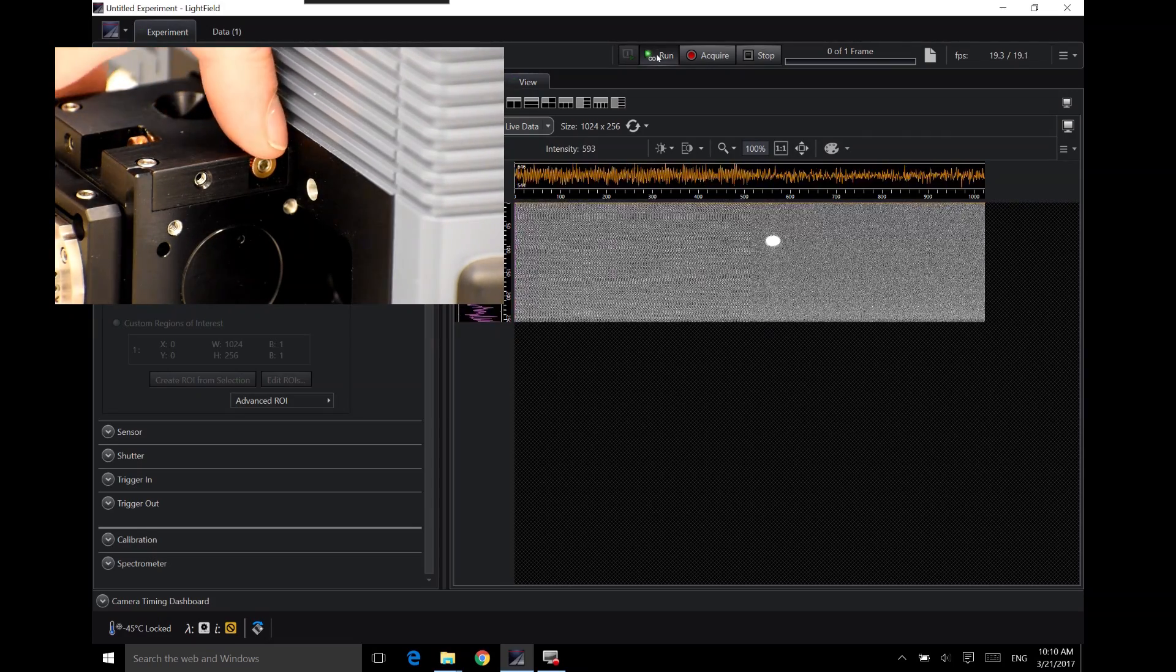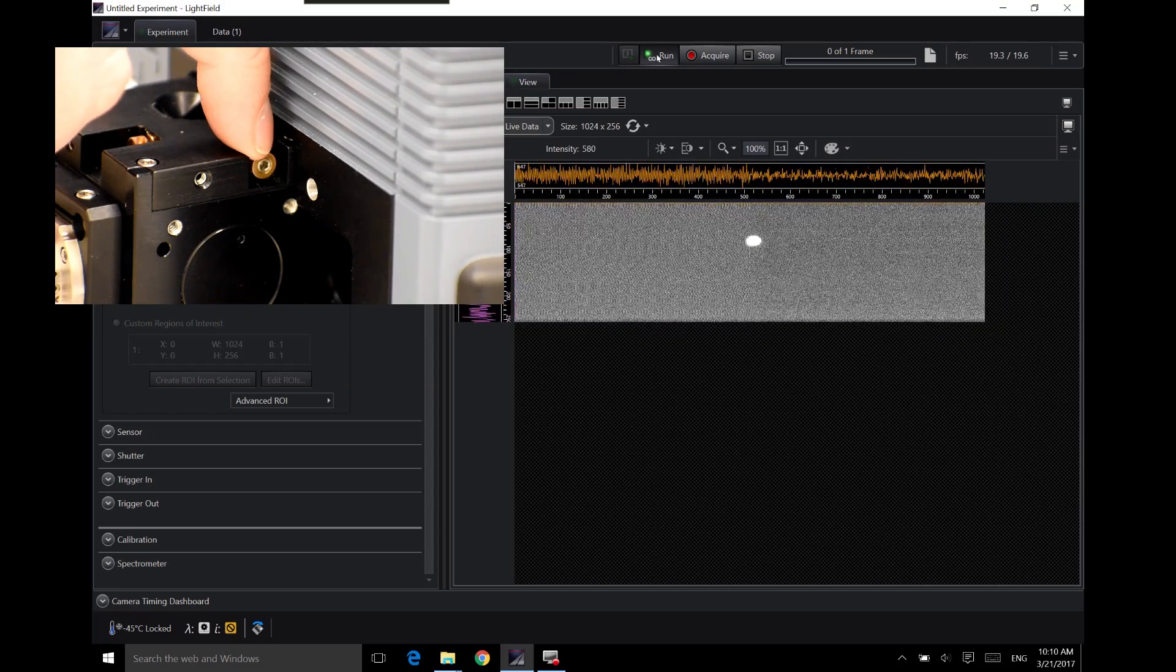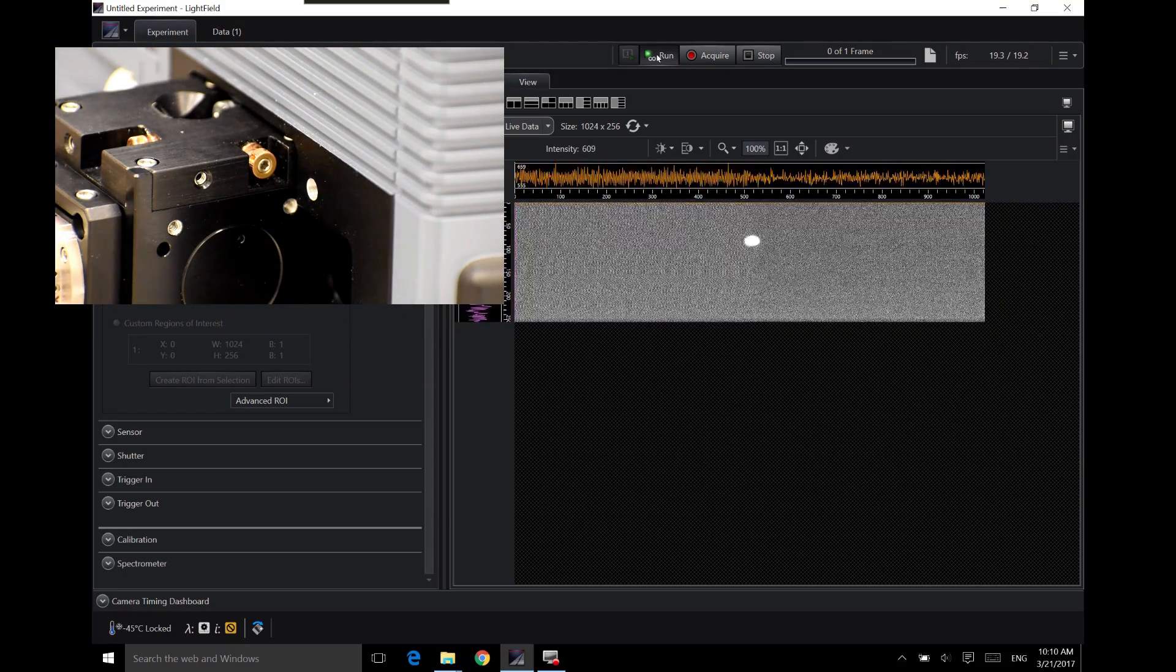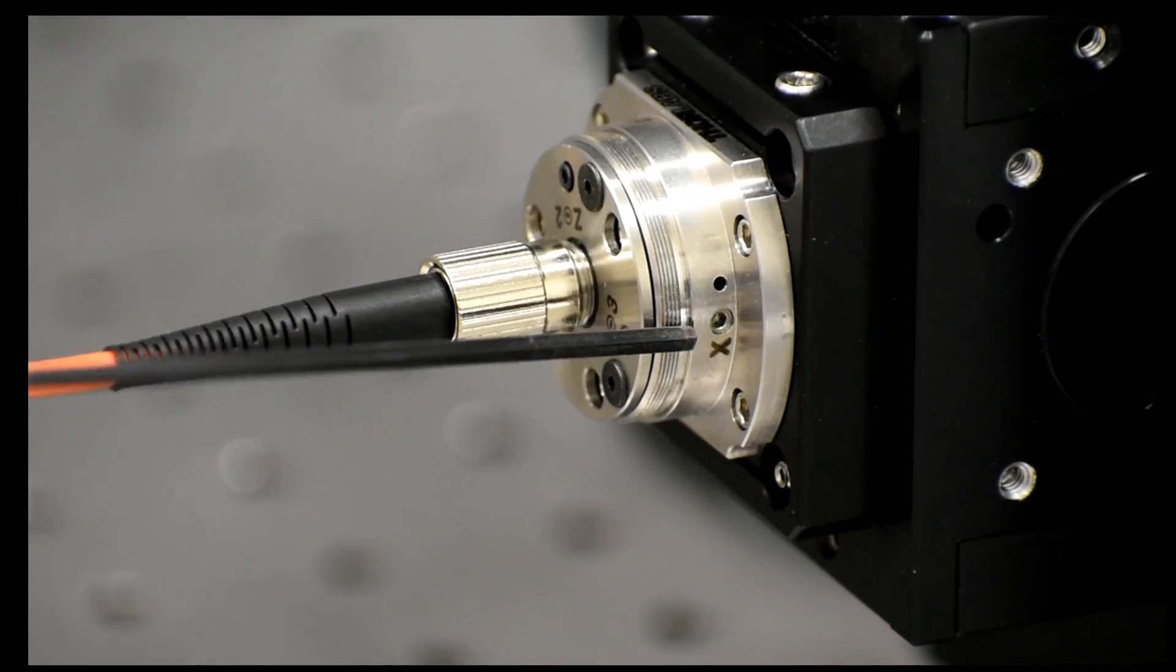Use the adjustment on the focus cube to align the fiber output with the entrance slit in the center of the sensor. There might be additional adjustments on the fiber coupler as well.